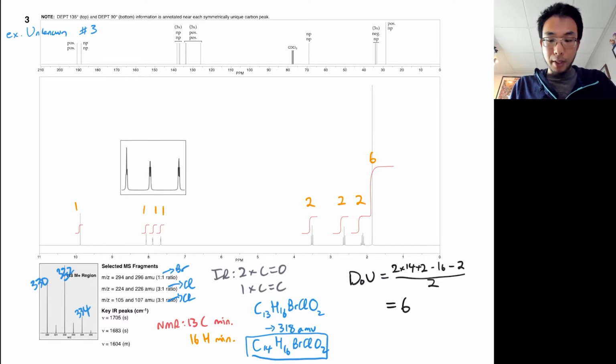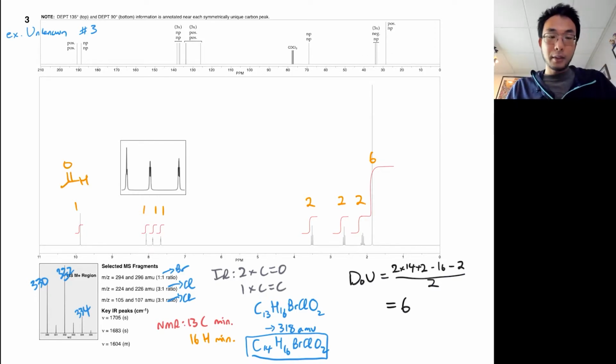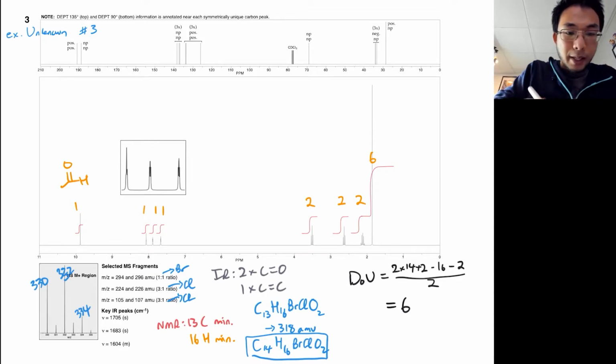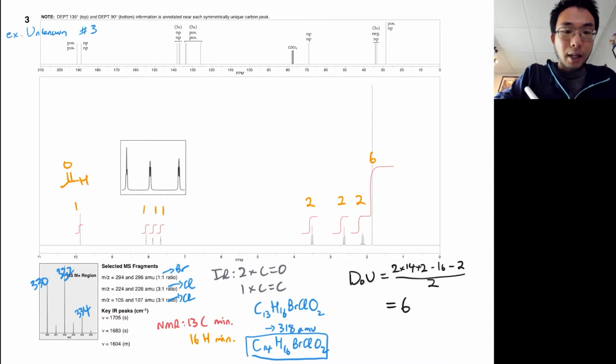So we definitely had carbonyls. Actually, if I look at my proton NMR, it looks like I have this signal near 10 ppm. We should have an aldehyde. Right? If I look at my carbon NMR, I have 2 signals showing up in the carbonyl region, both closer to 200 than they are to 160. That makes me think ketone and aldehyde, or ketone or aldehyde.